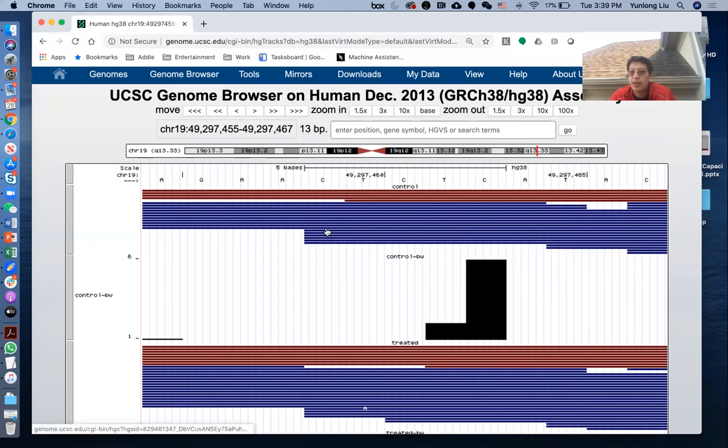We purposely shifted this a few base pairs into this read, because this is a Tn5 enzyme protection region. So although we identify the sequencing read like this, the cutting site will potentially occur in this location. That's why we put it at this location here.